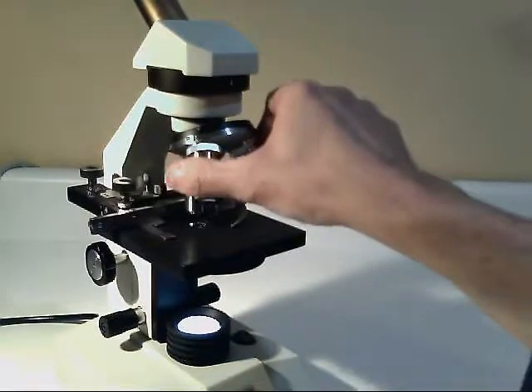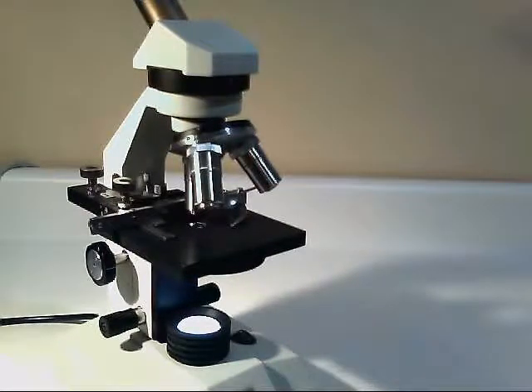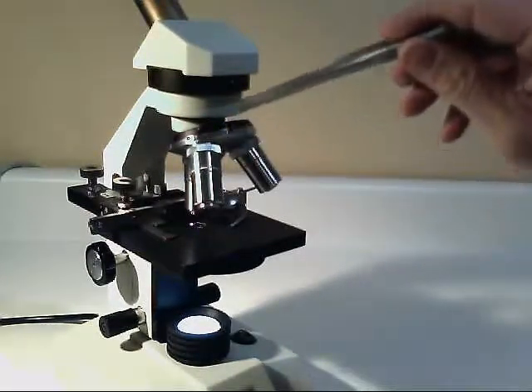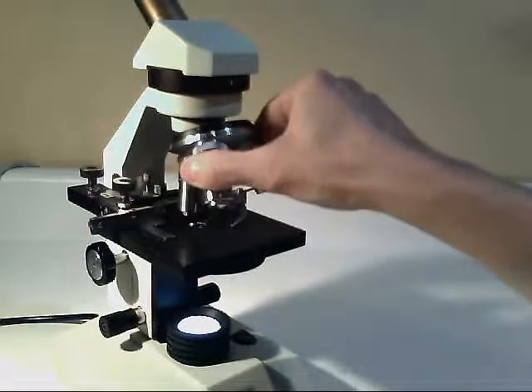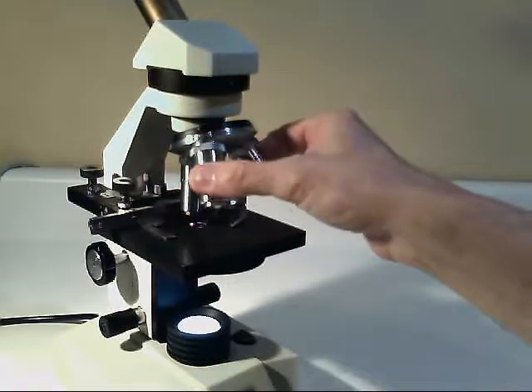When you're moving these objectives, make sure that they click into place — they'll make a small click or a thunk. That makes sure that it's lined up with the sample and the light passes through into the objective lens. If it's not lined up and it's a little bit off kilter, you won't see anything through the objective. So just make sure you hear that click.